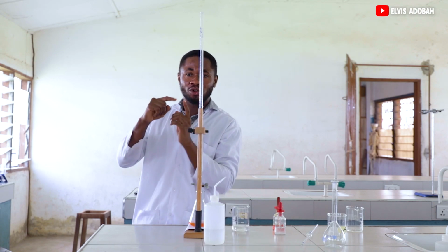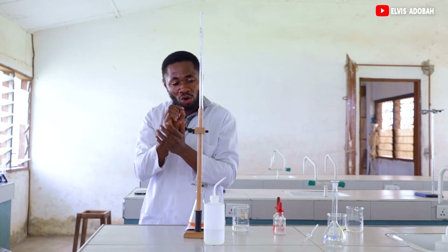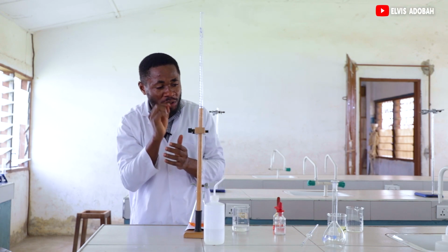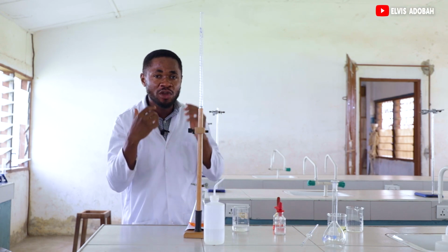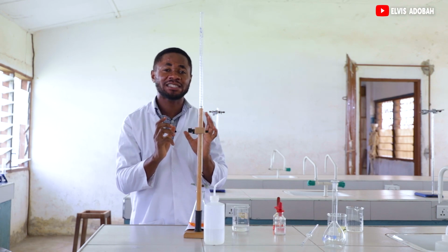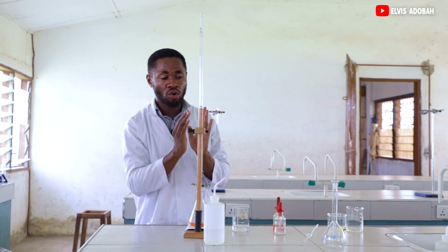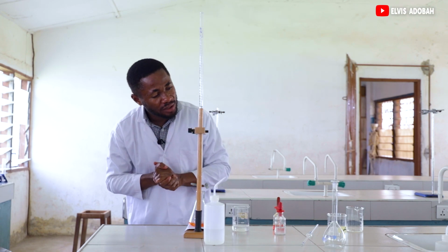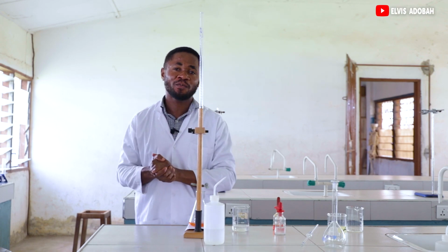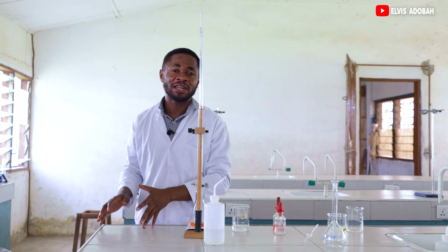The top of the meniscus is on the 25.70, but the bottom is on 25.80. And we read based on where the bottom of the meniscus is lying. So our endpoint falls at 25.80. Then we put that one down.